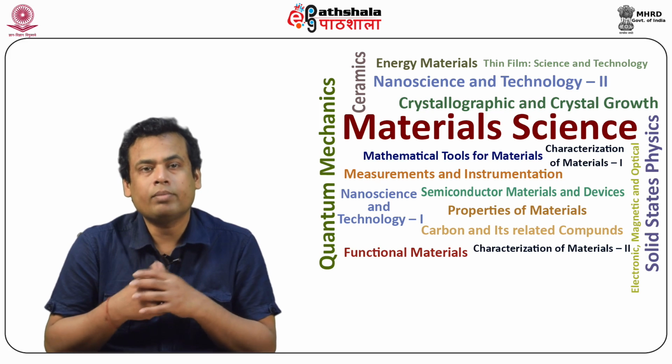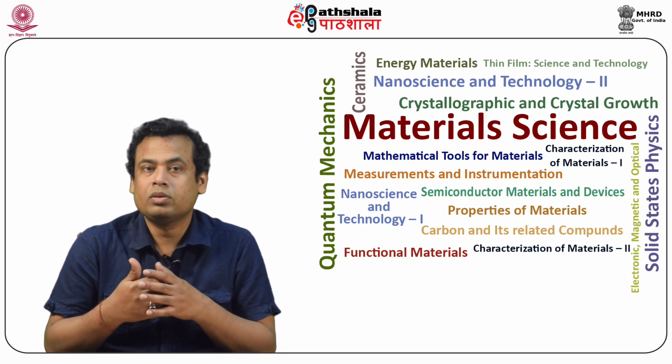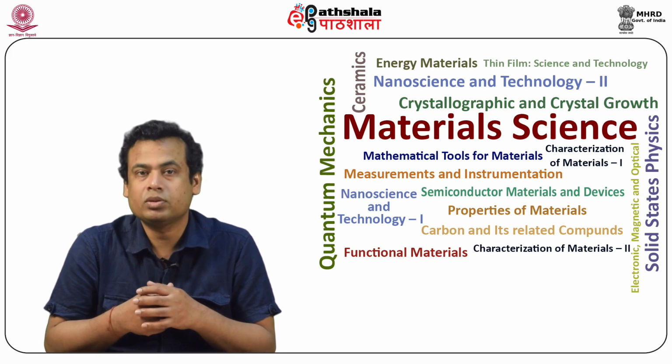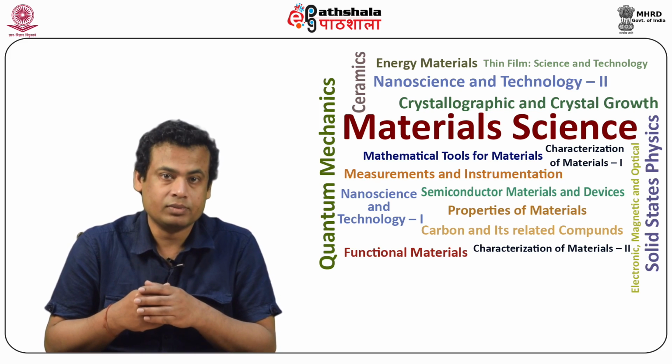So, how does the electron microscope work? The waves in an electron beam can be coherent, that is, waves of the same wavelength, or incoherent with waves of different wavelengths.